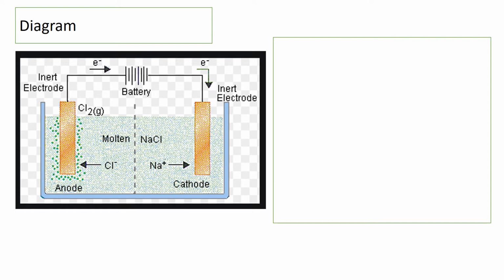So here we've got my molten solution, and it could be either molten or aqueous, because remember, ionic compounds only conduct electricity in molten or aqueous state. And that is a fictitious line down the middle, and that fictitious line isn't a semi-permeable membrane, which lots of people, in the pressure of exams, start chatting about. It's just the edge of the draw of those electrostatic forces. So be aware that that line is fictitious. It's just saying everything on this side that's positive will move to here, and everything on this side will move to there. So here we are.